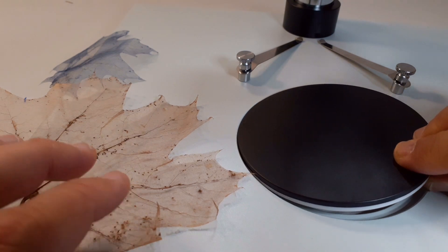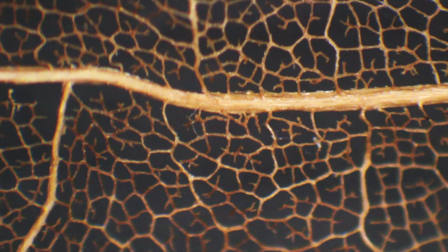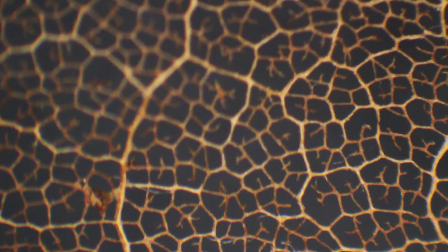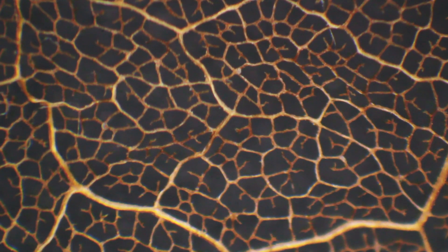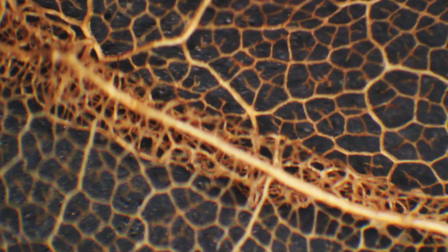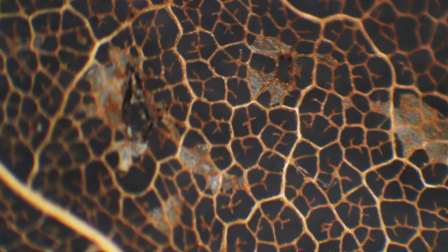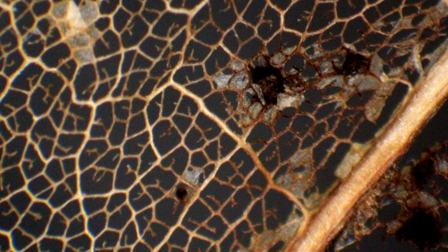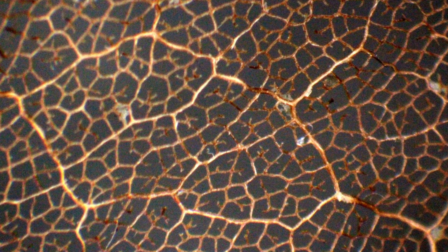There is this little plate that I can use and turn around, and now I get a different background color. I'm going to try this with a dark background. This is what I see with a dark background — the contrast is a little bit nicer. I'm trying to find an optimal place somewhere. I just want to find different places. I have to refocus again because the skeleton is not completely flat, and I'm simply looking around for some interesting objects. Here the leaf was a little bit wrapped around and had a crease. In any case, luckily not many of the vessels were damaged during the brushing process, so it works quite well. Here I'm doing a digital zoom and I corrected the images a little bit for color contrast. I can recommend doing this.